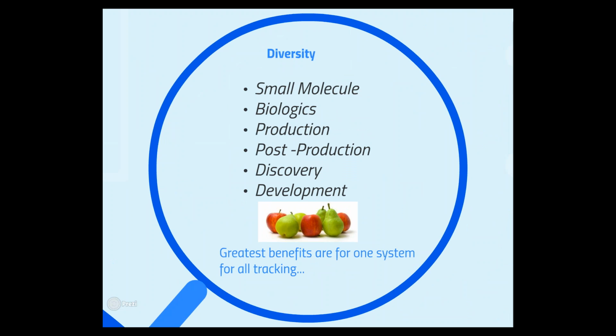To drill down into these a little, we'll talk about diversity first. Traditionally there's been a spread between small molecule research and now large molecule biologics and antibody research work. So we need a system that's capable of managing not just small molecule sample-based requests, but also biologics requests.